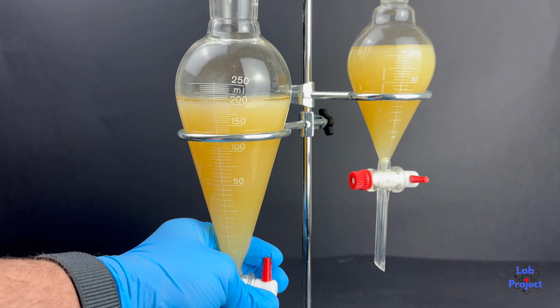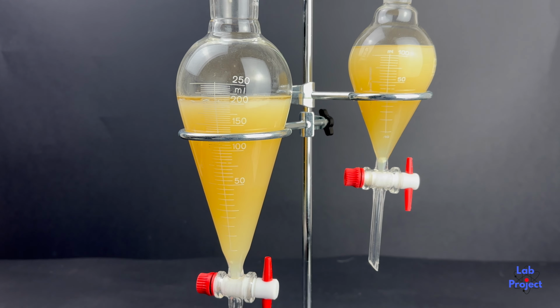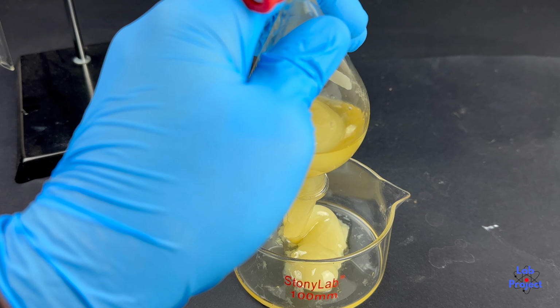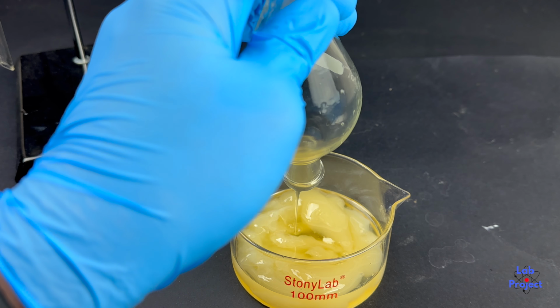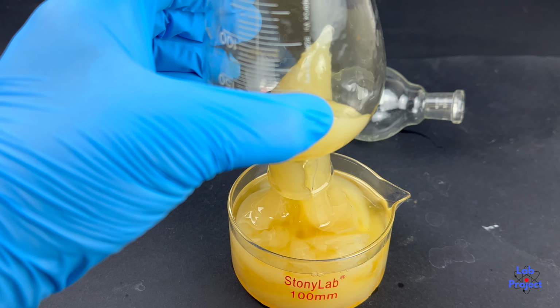The mixture had solidified. It had become kind of gelatin-like. I tried transferring everything into a crystallizing dish, but I only ended up making a big mess. So I decided to throw everything away and start over, but this time with only 150 milliliters of oil.